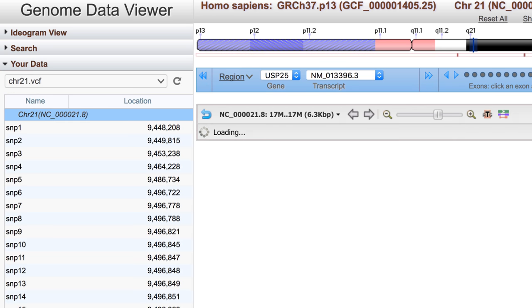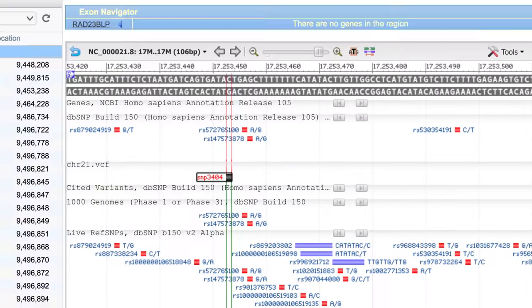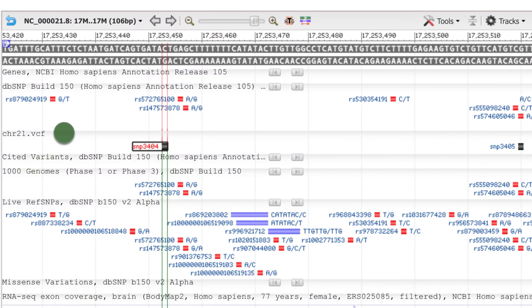Your new track appears in the sequence viewer, allowing you to compare it with the wealth of NCBI tracks.